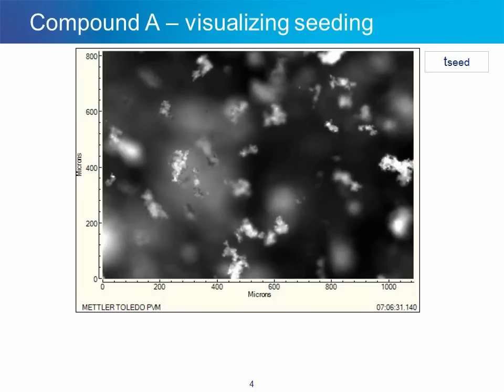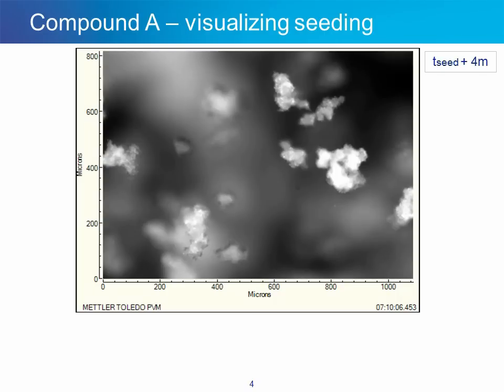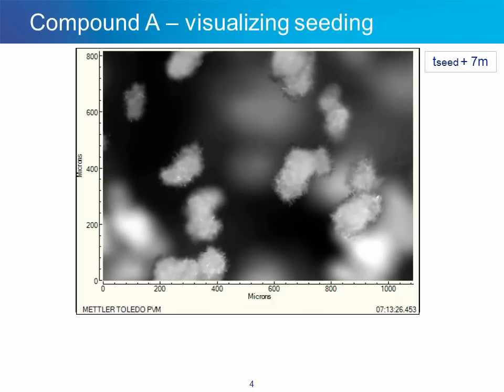This is how seeds actually exist in the process itself, rather than what they might look like after sampling and preparation for visualization under an offline microscope. We can see the seeds are added to the crystallizer and they form these loosely bound flocs. Over time, these loosely bound flocs appear to form more densely formed aggregates or agglomerates. After seven minutes, we really begin to see the direction this crystallization process is going to take — seed crystals have agglomerated, and what we're seeing appears to be surface nucleation with small needle-shaped crystals growing out from the center of these seed aggregates.